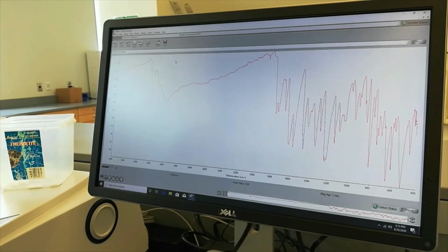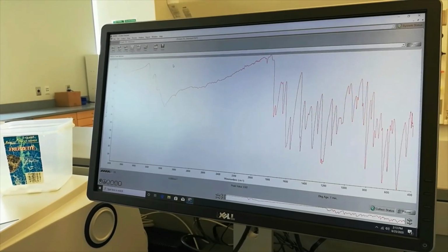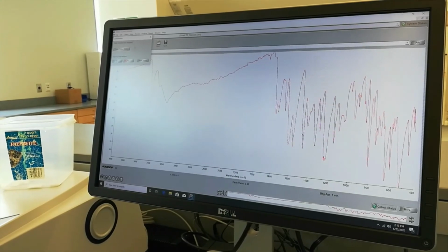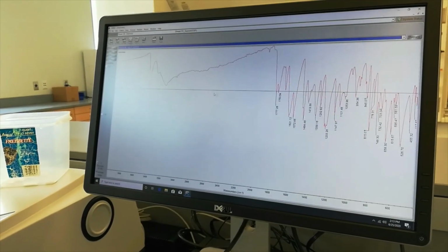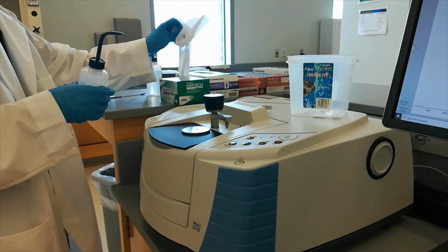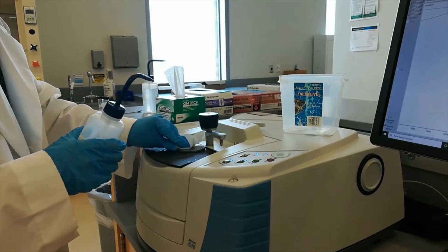For this experiment, you need to look at the wave number region of 700 to 900 in the IR spectrum in order to determine if the iodination has actually occurred. Add to a new window, yes. Okay. Then find peaks, adjust the horizontal line until you cover all the peaks. Then click print. Then clean the stage using isopropanol.